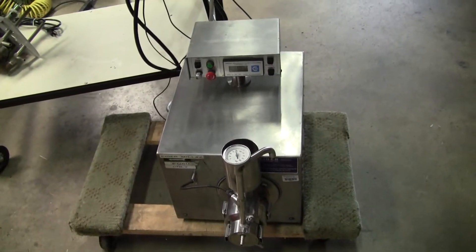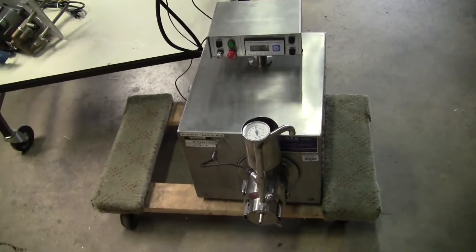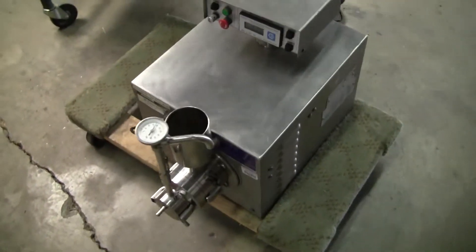Hi, this is Michael Natow from High Tech Trader. Today we're looking at an Iger Mill. Iger mills are very useful tools for grinding.